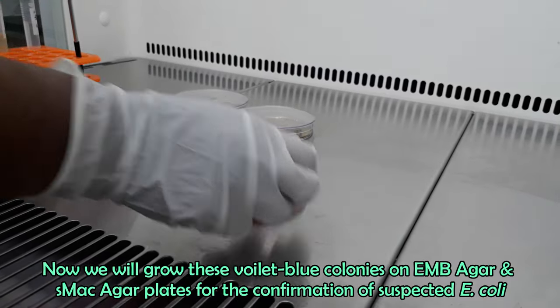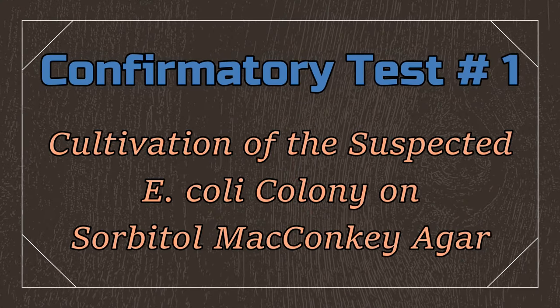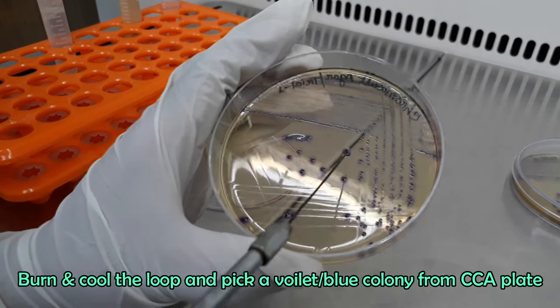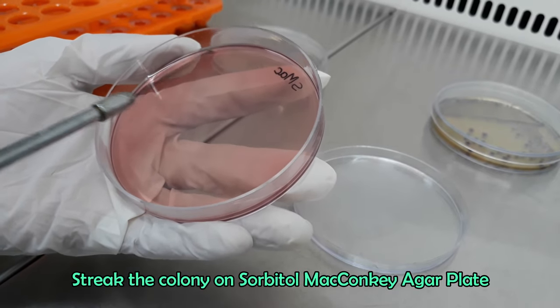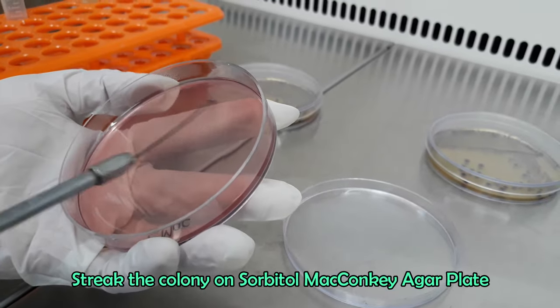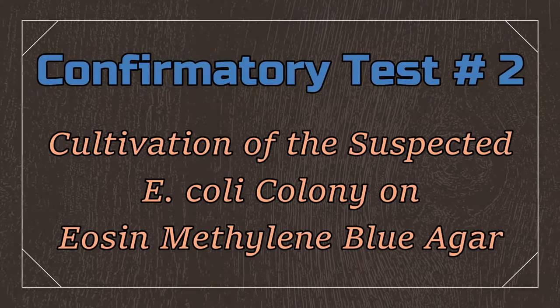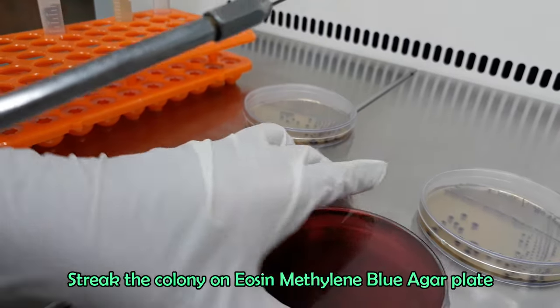For the confirmation, inoculate the presumptive E. coli colonies on EMB agar and SMAC agar plate by streaking method. Pick a colony from chromocult coliform agar plate and streak on SMAC agar plate. Label the plate. Pick another colony from the chromocult plate and streak on EMB agar plate.